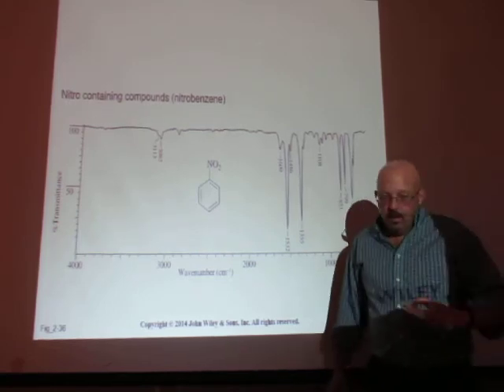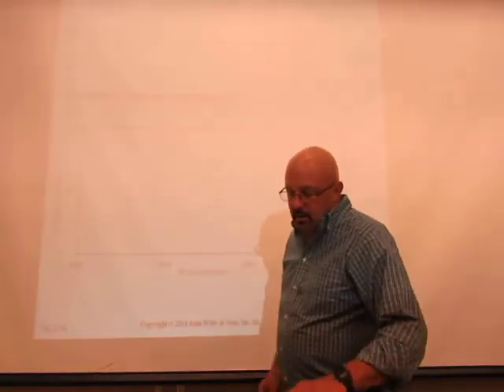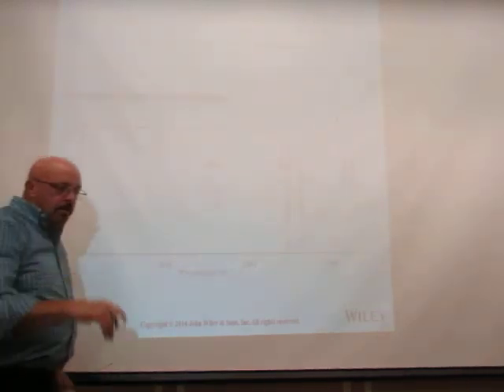The next one that we're going to look at is a nitro group. Nitro is an NO2 group. This is a nitro group drawn out.